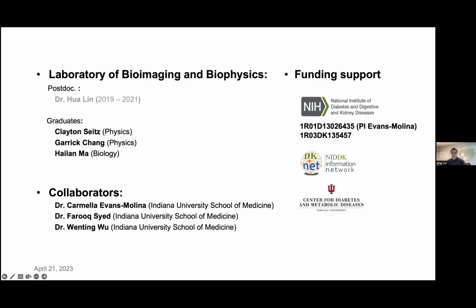Oh, that's a very good question. For the initial analysis of mRNA in the nucleus or in the cytoplasm, our attention was driven by a lot of PCR experiments and sequencing experiments. So in that case, we were primarily interested in the overall RNA expression, which means including the transcription sites, as well as the mature mRNA. So we use different strategies to count both RNAs.